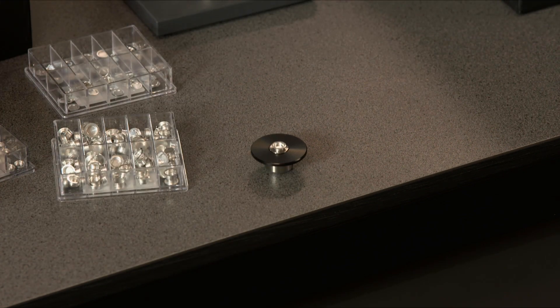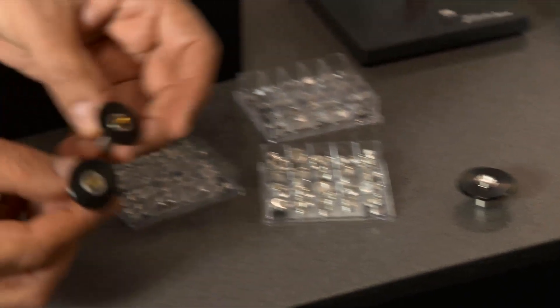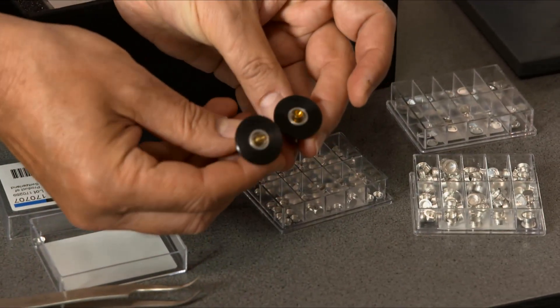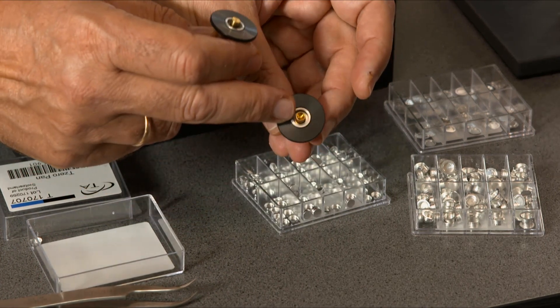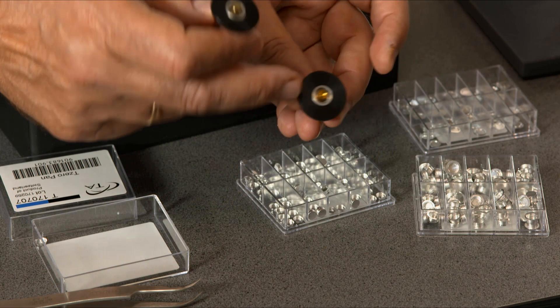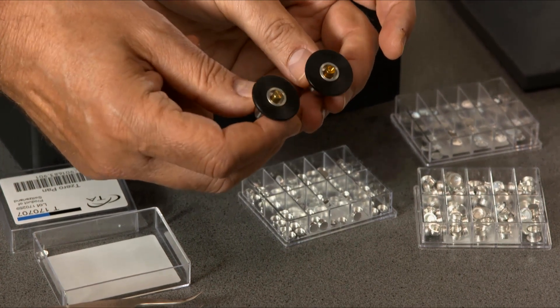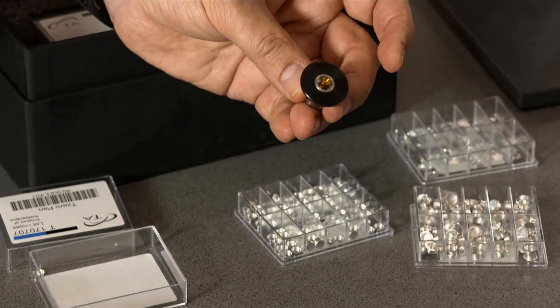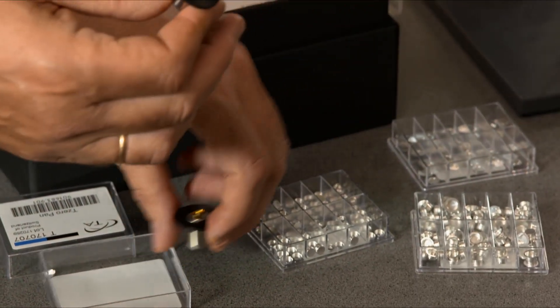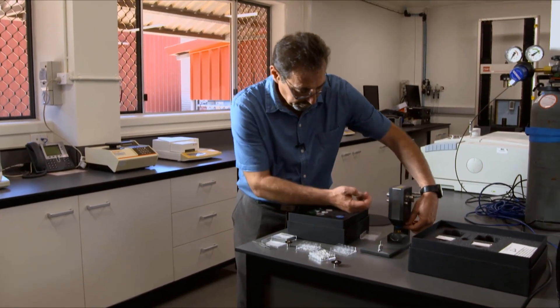Now the difference between those two upper dies is one is flat and another one has concave. The one with concave tip is used when you run pieces of polymers so that you form a little dome on top of it. So in this particular case, I am going to use flat one. I remove the one which we used before.